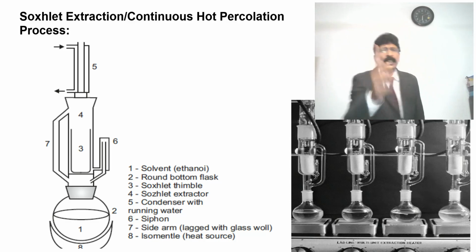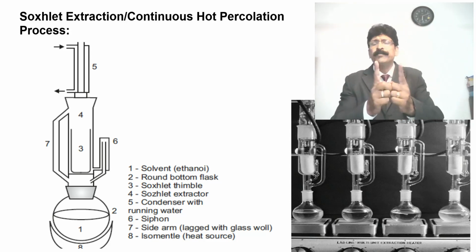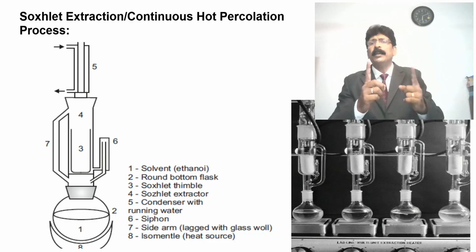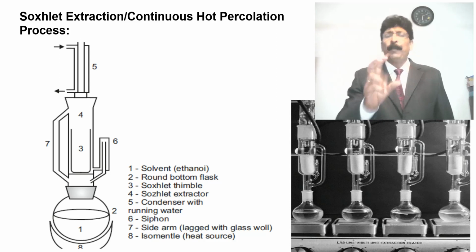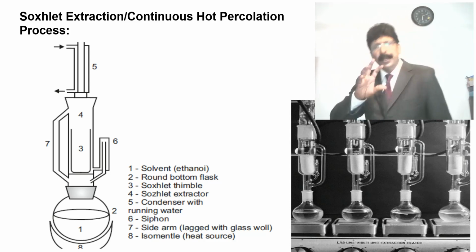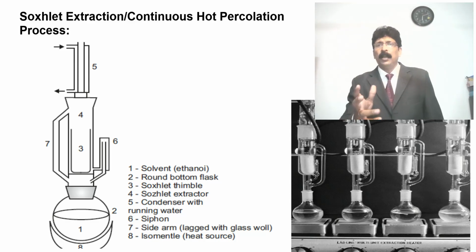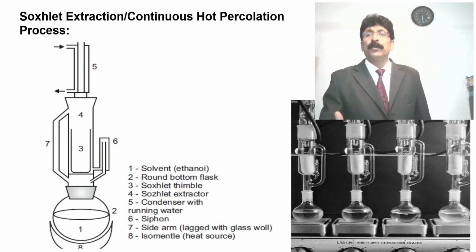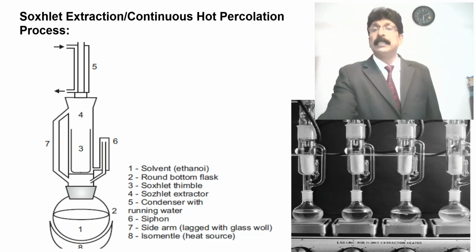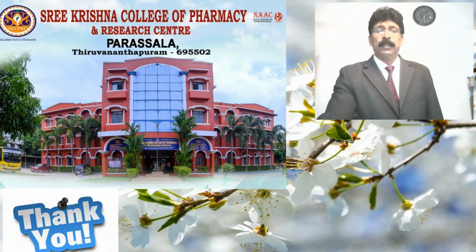So clearly the students have to write yourself, make your notes and bring them to my office and submit. That is very important. It is a very important topic, the Soxhlet apparatus. A student should know, and you should prefer to do the practical in your lab, especially in our institution. Try to come and do it. You can ask anytime. I am ready to help you fix this Soxhlet apparatus in our lab. Many types of Soxhlet apparatus are available in our lab.